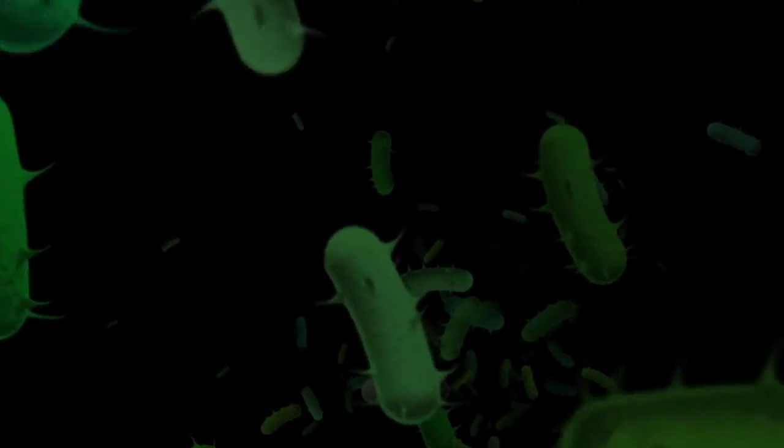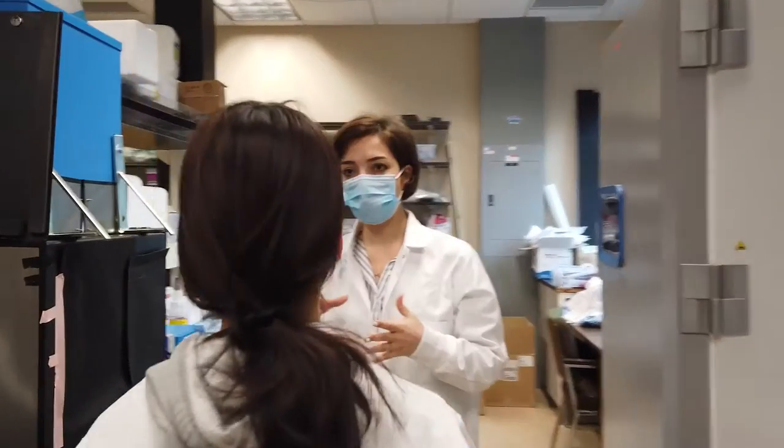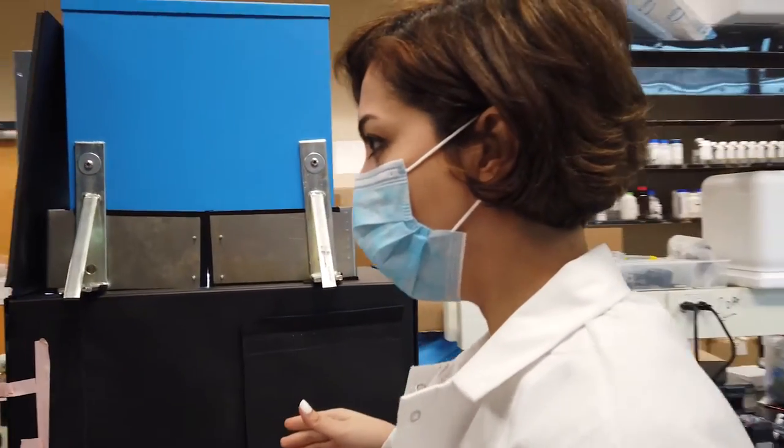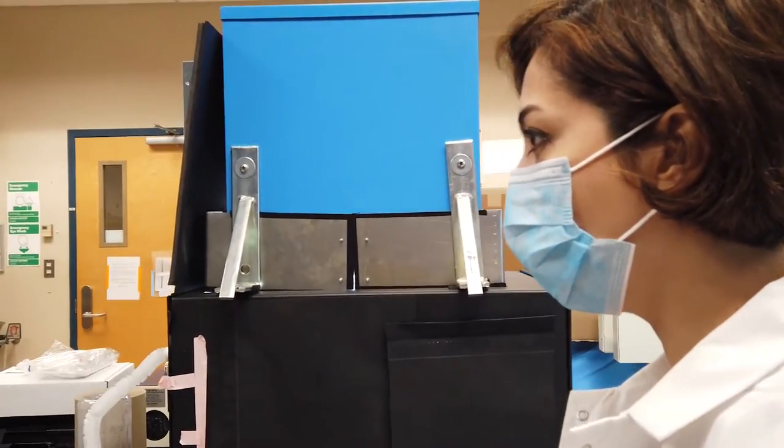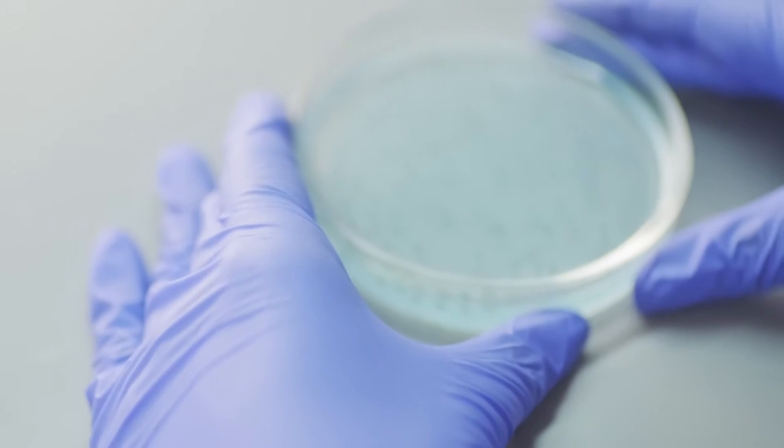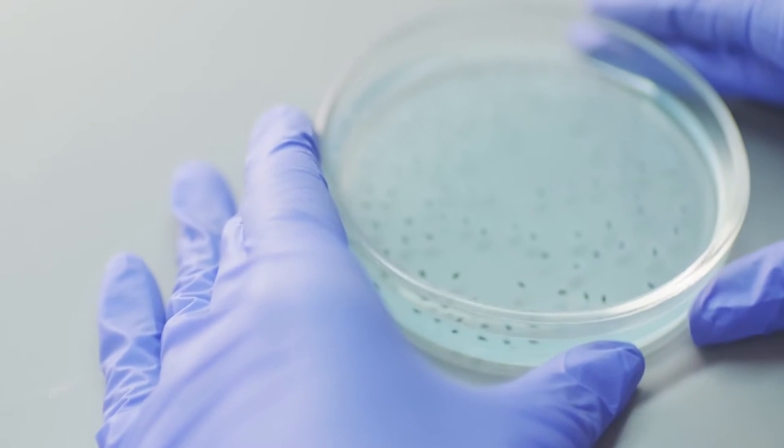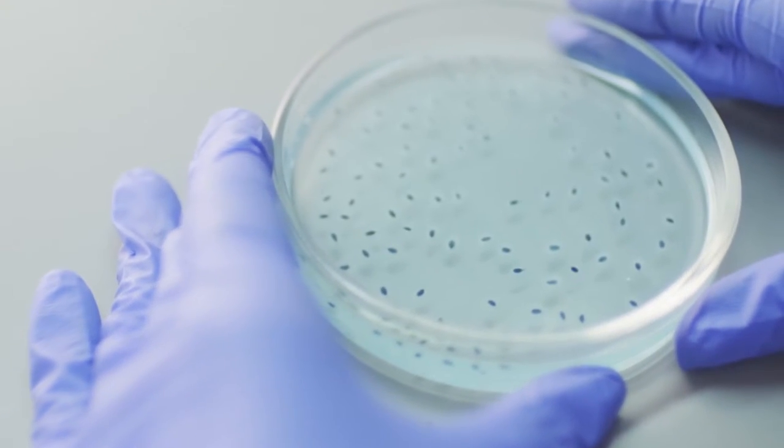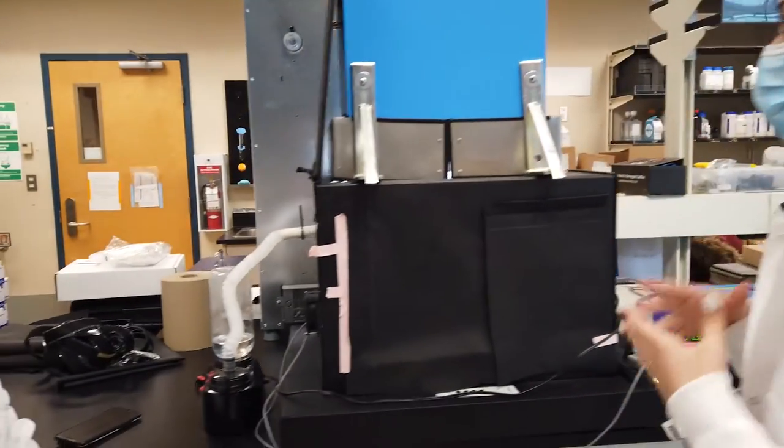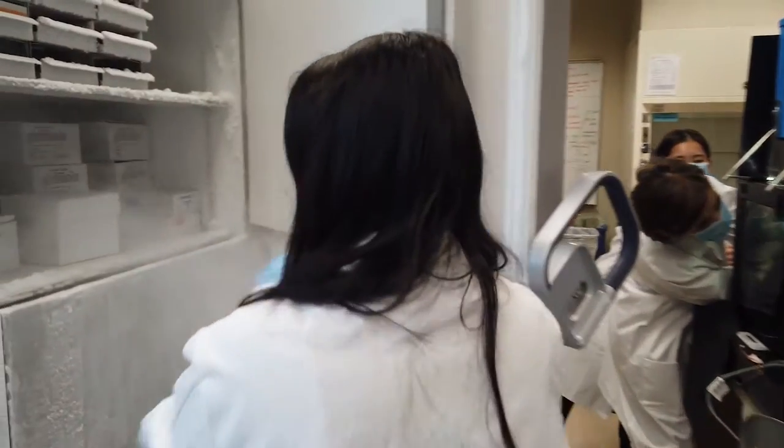When it comes to microbiome science, you're interested in understanding what different microorganisms are living in a community. The very first question is how many microbes do I have in soil, in air, or in my gut, and then what are those microorganisms.